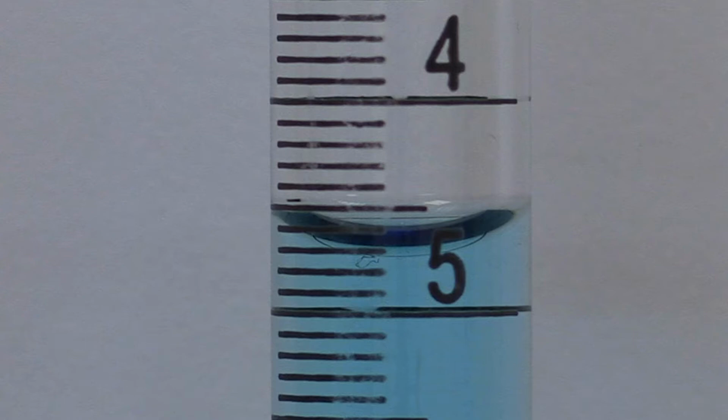Let's focus on reading the burette. Unlike the graduated cylinder, with a burette we read from the top down. Notice the graduations. On this device, the graduations are each worth 1/10. 0.1, 0.2, 0.3, 0.8, 0.9, 1.0. Like all glassware, we're going to read this at eye level.